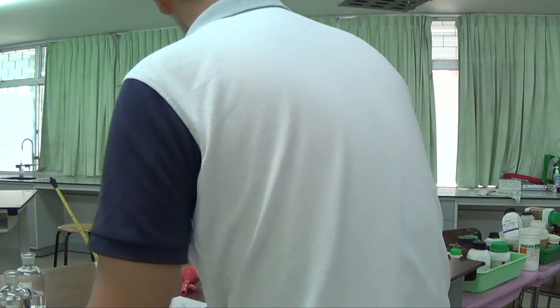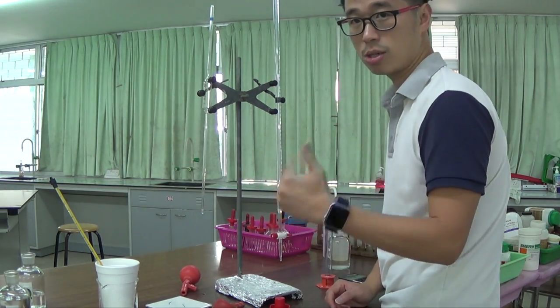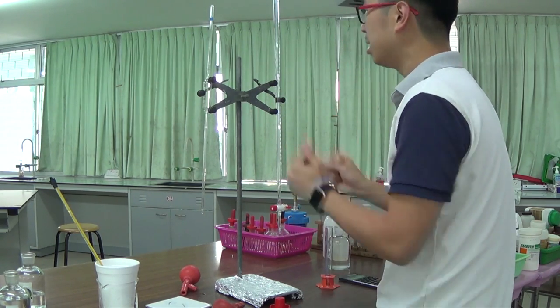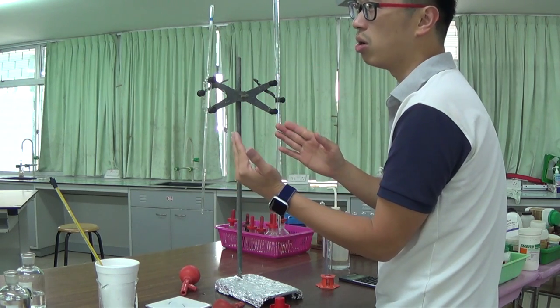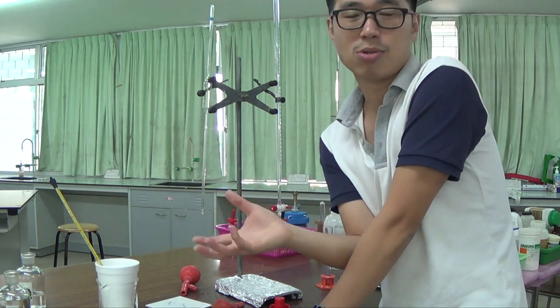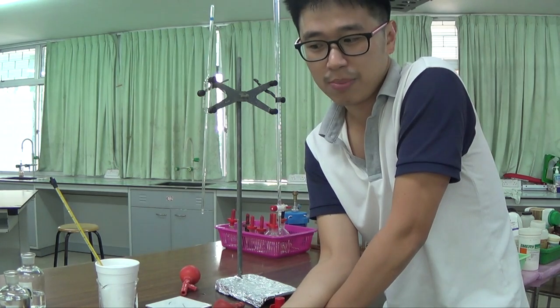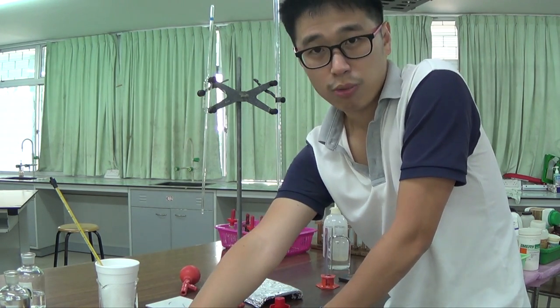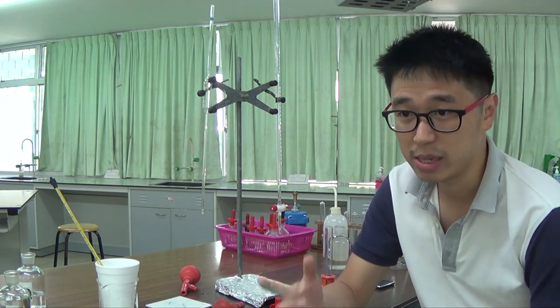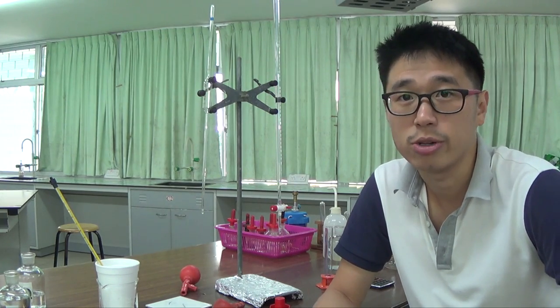So I get 5.00. I started off from 0.00 cm³. I keep saying 0.00 cm³ because I'm used to the higher level of accuracy, which is 2 decimal places from a burette reading. We use the same burette for all A level and AS level. So for me personally, 2 decimal places is the way. If Cambridge marks your work, they will know that 2 decimal places is something you have to do eventually when you go on to do A level chemistry. It's up to you if you want to use 1 decimal place, which you're probably happy with at IGCSE or O level chemistry. But whenever you see me saying 2 decimal places, 0.00 cm³, that's because I'm following the plus minus 0.05 cm³ accuracy of a burette.